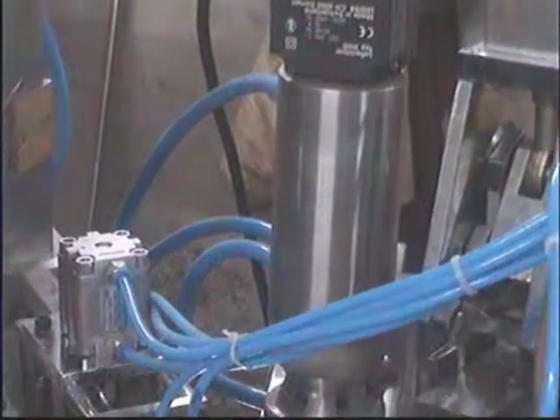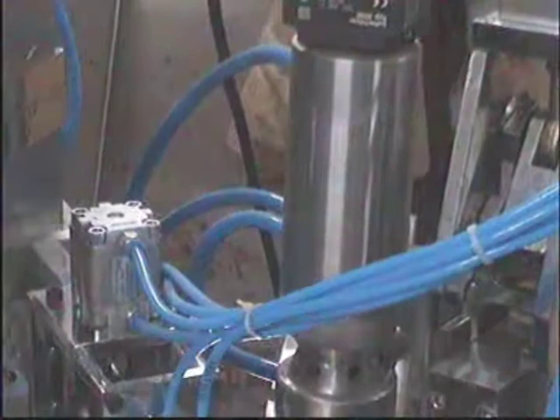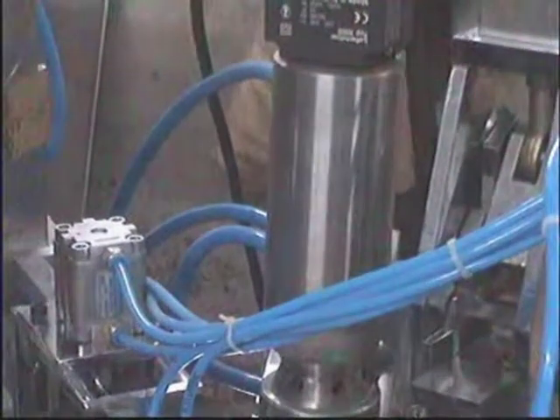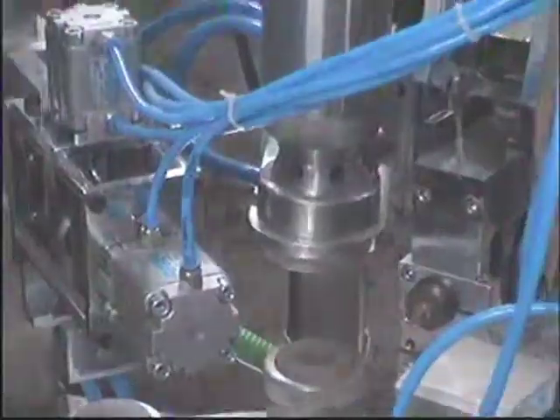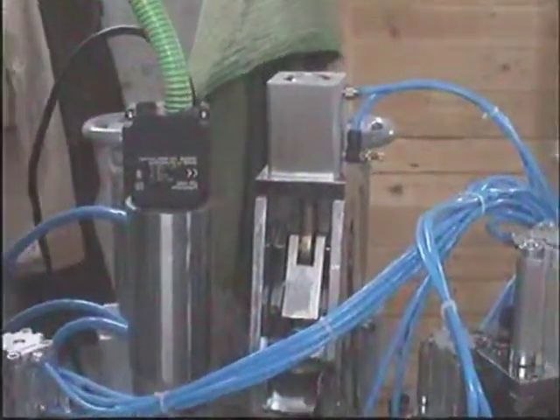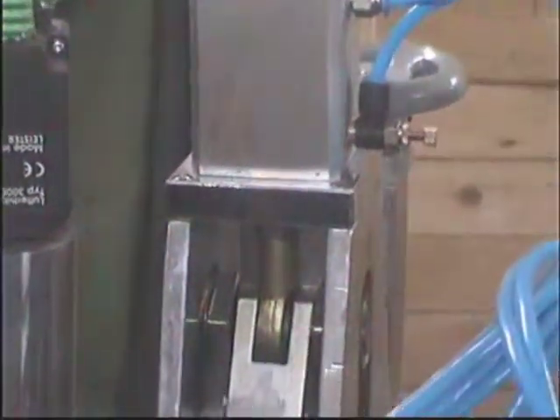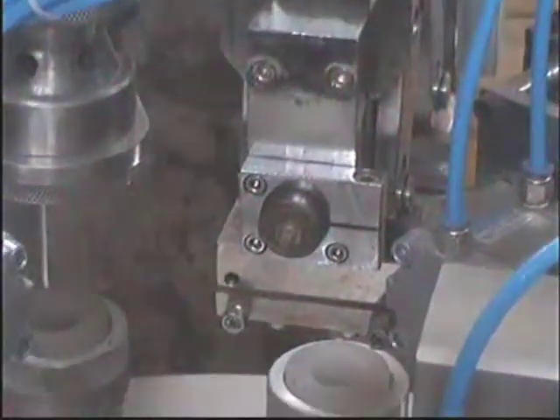In the center you are seeing the water jacketed arrangement which ensures that the tube, while getting hot, does not collapse. This is the crimping sealing of the lamy tube.